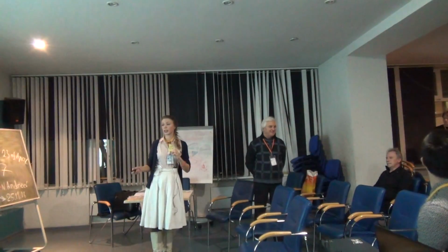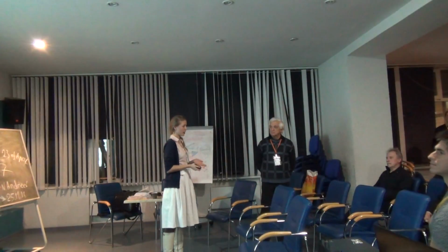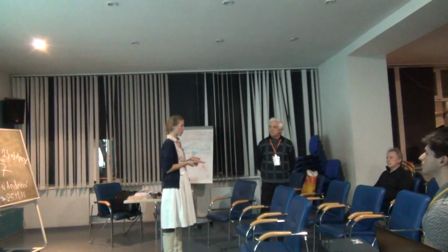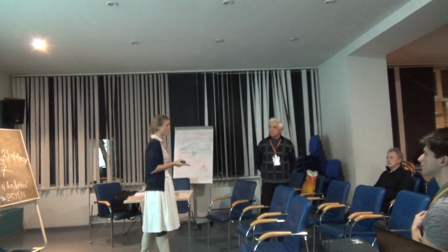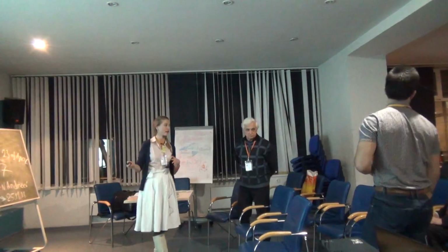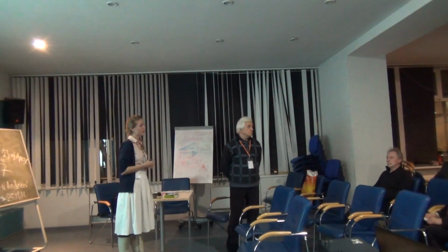Помимо этого мы использовали статистический анализ, множественное сравнение средних, которое показывает, отличаются ли достоверно группы между собой. То есть нельзя просто так по усам сказать. Нужно составить статистическую гипотезу и проверить ее. И вот я здесь пишу, когда А и Б — это разные группы, то есть они достоверно отличаются друг от друга.